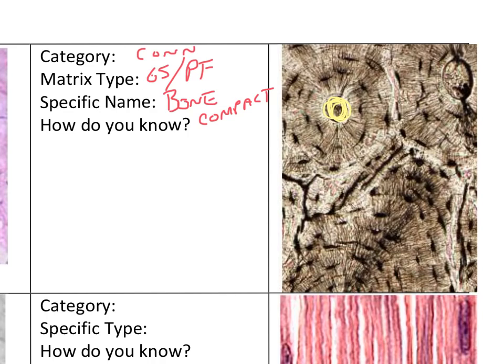You see blood vessels in various places. There'd be one just off the screen down here. You see blood vessels, but more significantly, surrounding these blood vessels, you see cells, what are called osteocytes, surrounding them, almost like a bullseye in places where people miss the bullseye. All the space in between there, in between here, is going to be your ground substance and protein fiber matrix with the cells scattered around.